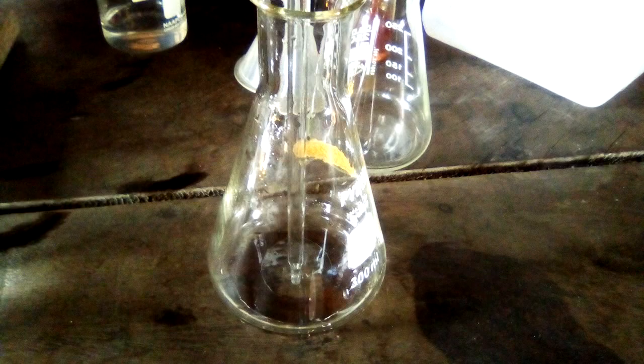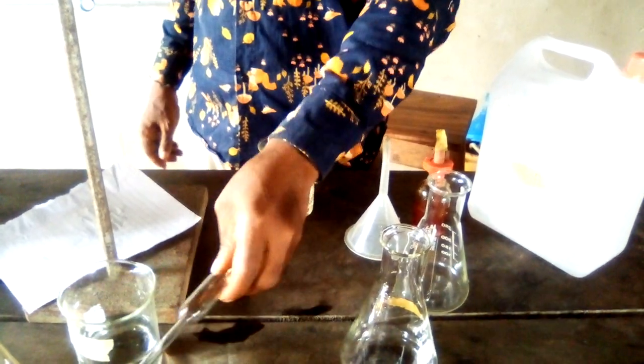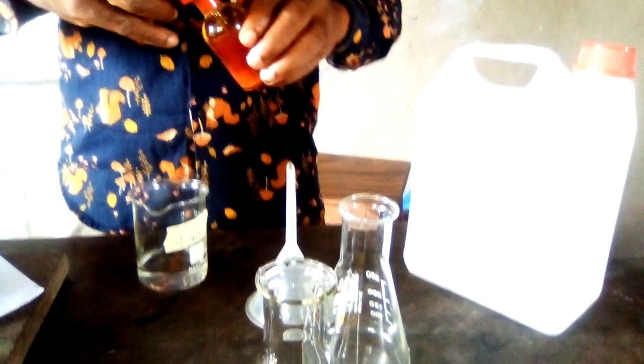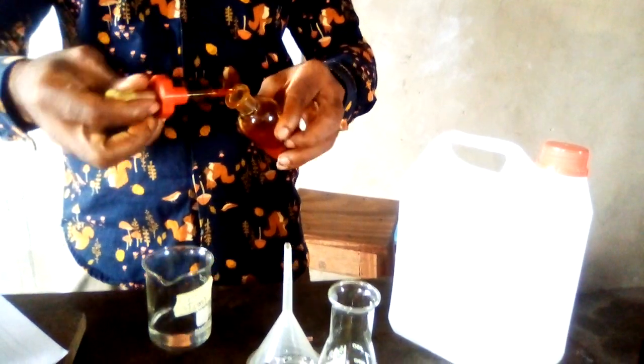After that, just when you have drained the whole alkali, touch the bottom of the conical flask with the tip of the pipette and remove it. Don't blow out the extra drop. The extra drop may be an additional drop of the base, because the pipette is calibrated to deliver exactly 25 cm³. So remove it, then add indicator to the base. Okay, 2 drops. Then we now titrate.